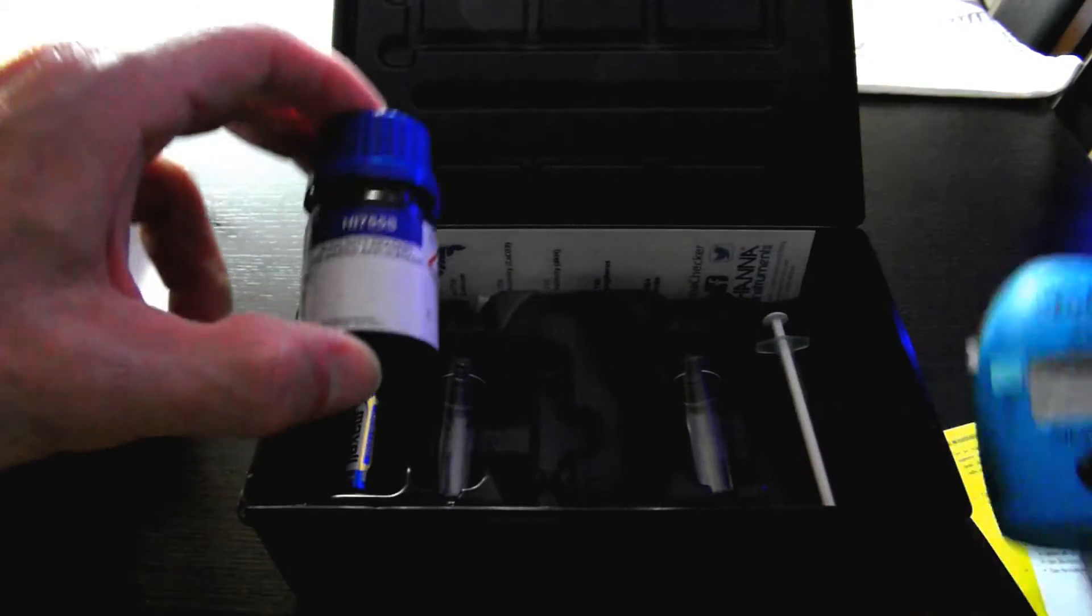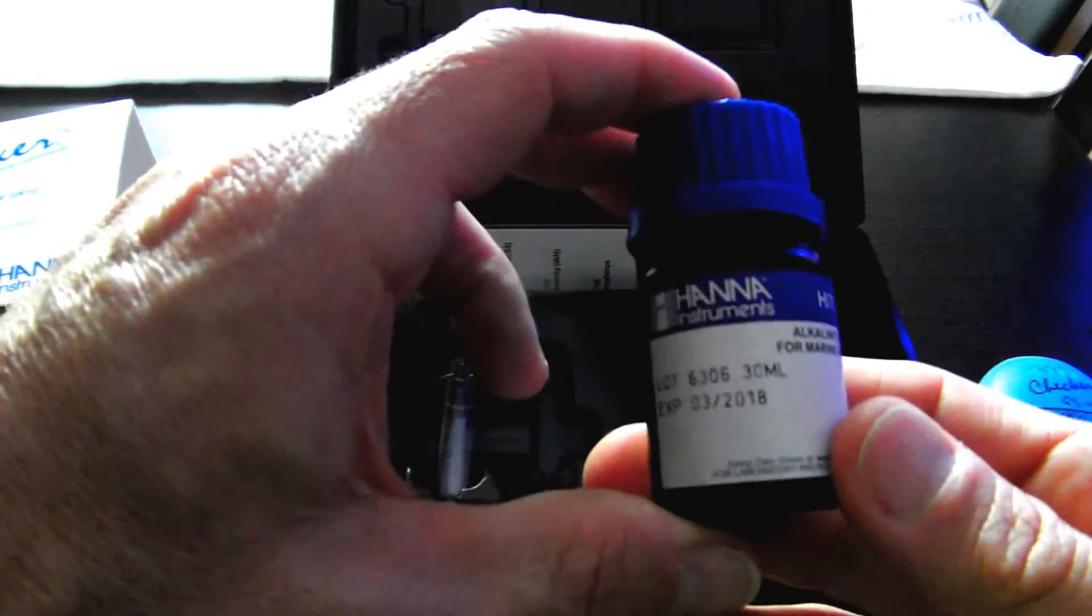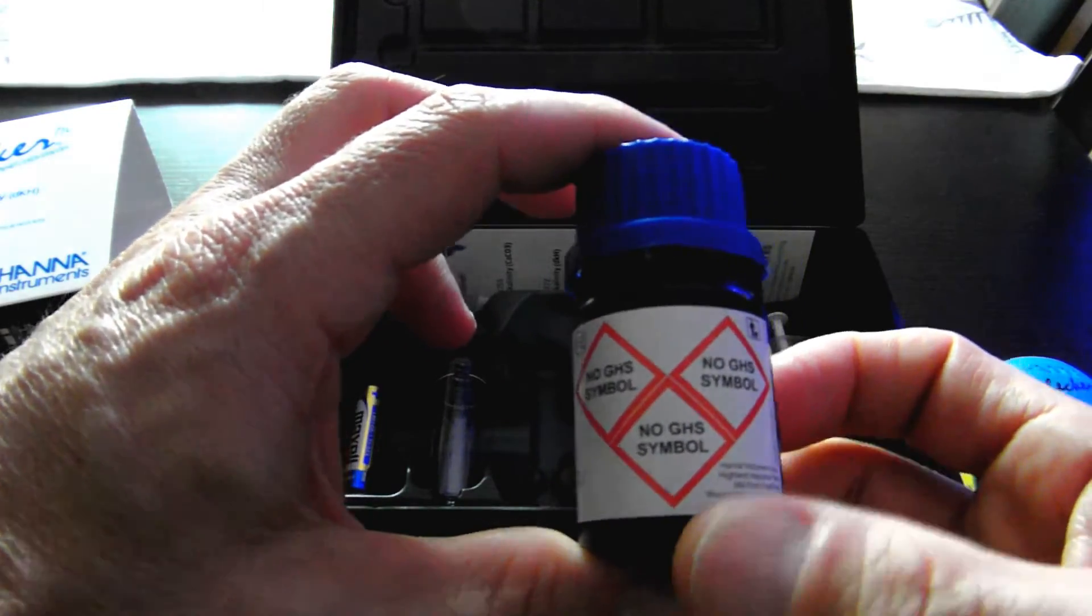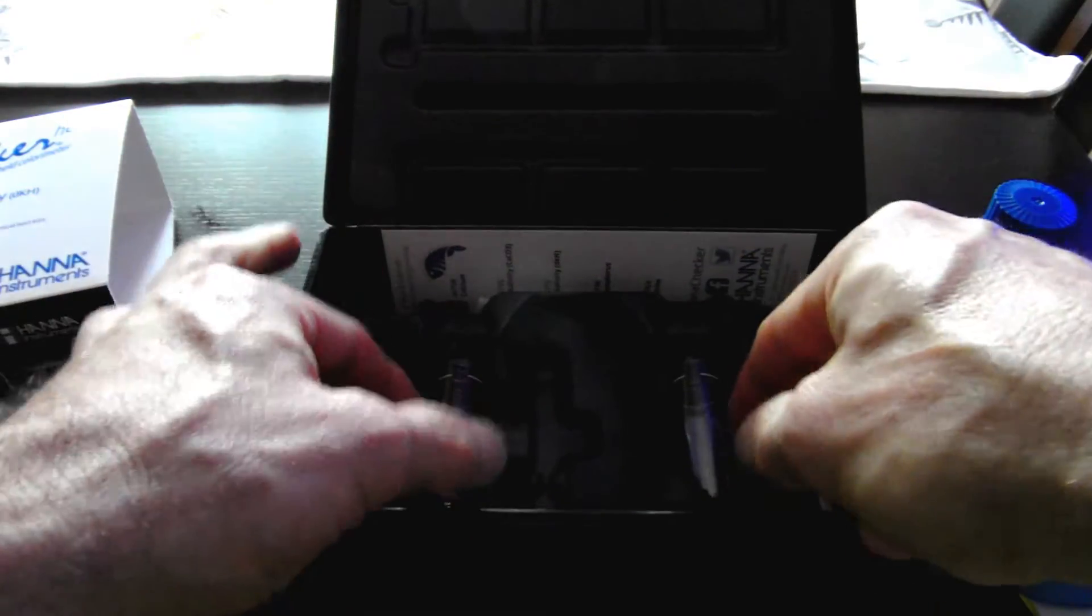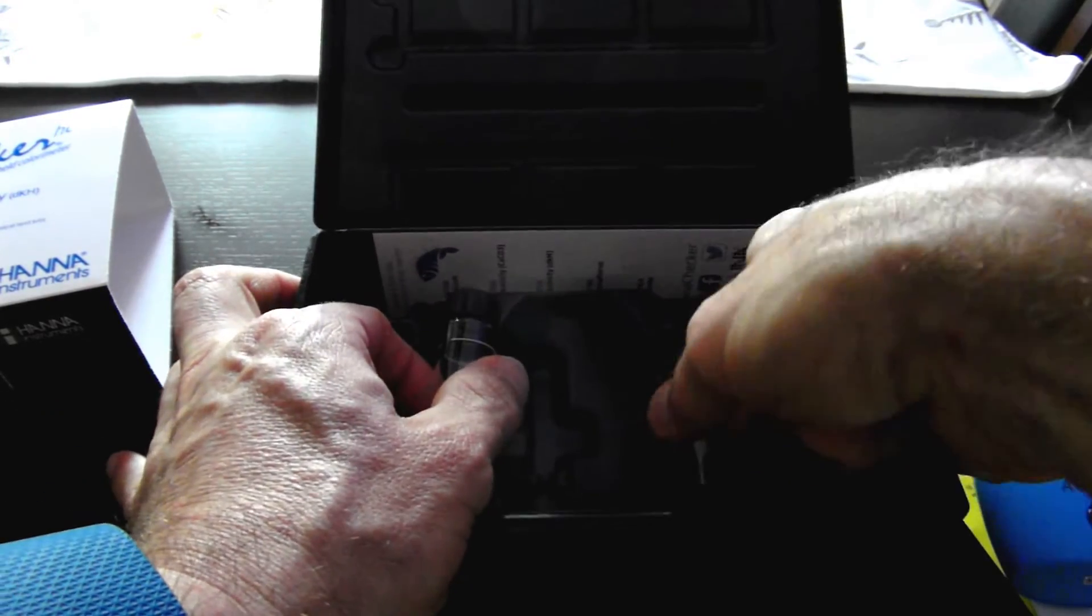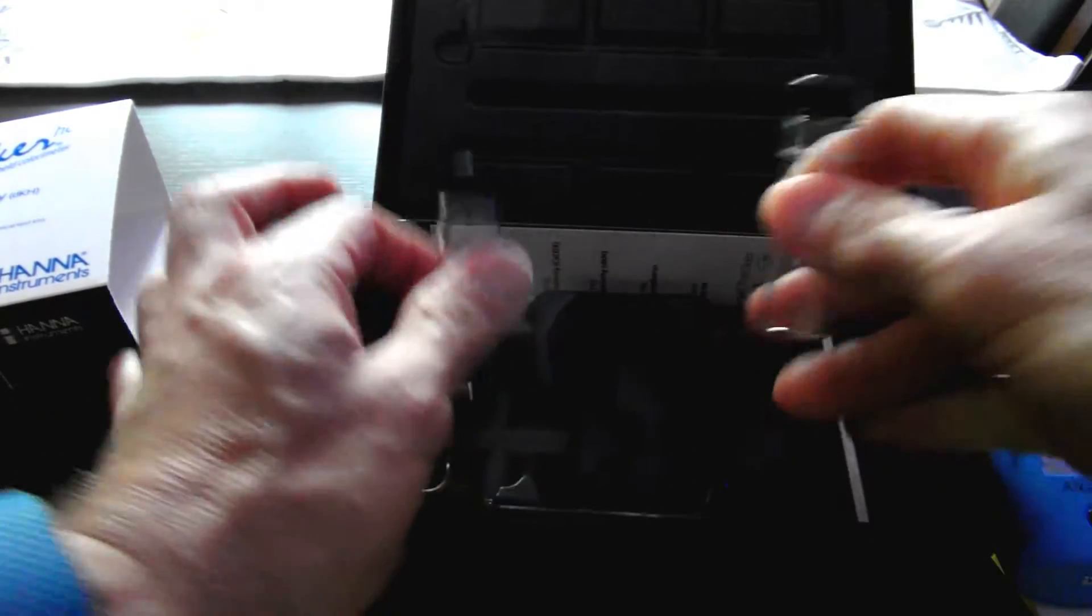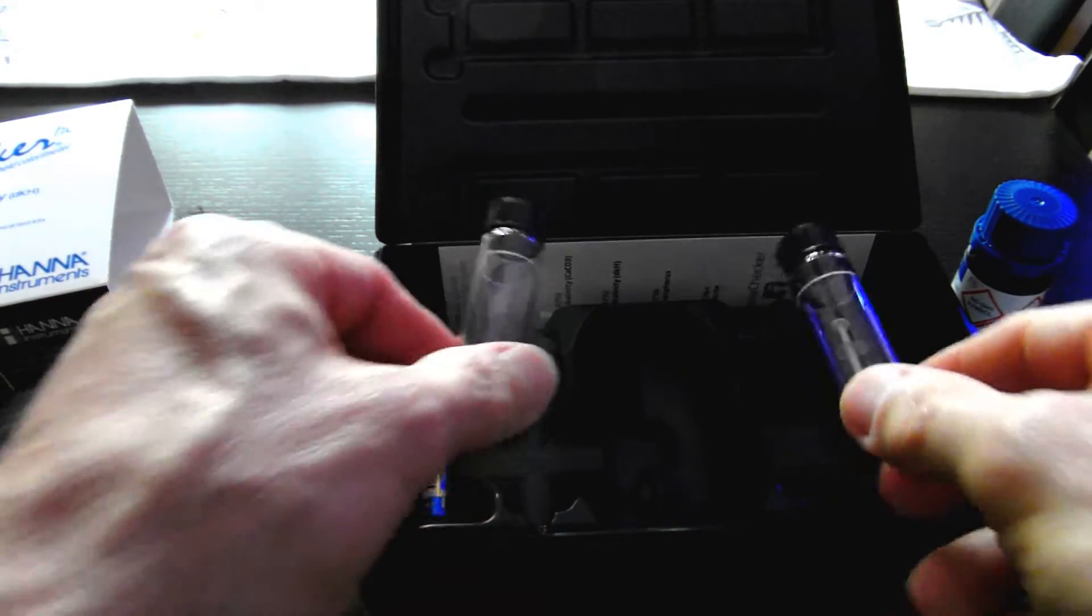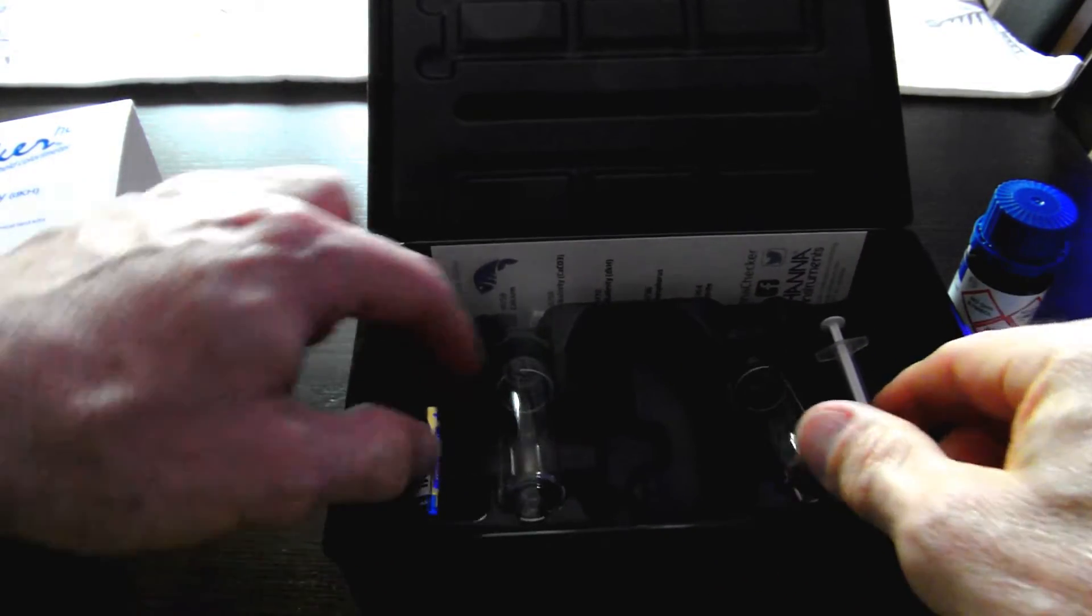Looks like it comes with a reagent which can be reordered as needed. Got two little glass cuvettes for testing, I imagine the aquarium water versus the reagent, and we'll find out how that works once I read the instructions.